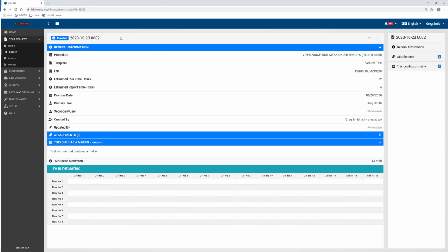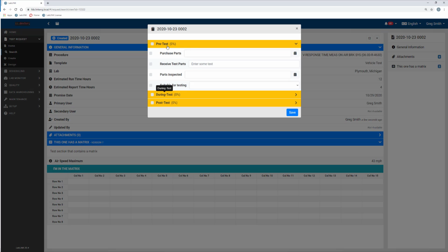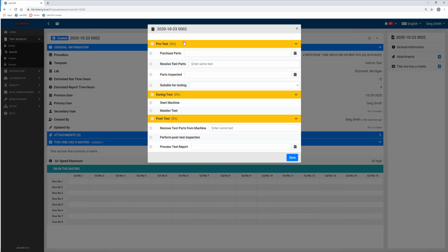Okay, now I've created a test request. This is my test name that you see here. Now if I go to the drop-down menu like we did in the beginning of the video, I can go to Checklist. I'm going to open up each one of these checklist headers, and we'll see the different types of fields that we have here. You'll notice we have different checklist item types. So this is a date field. If I click on this, it gives me a date for when the parts were purchased. Then I'll check that off as completed.